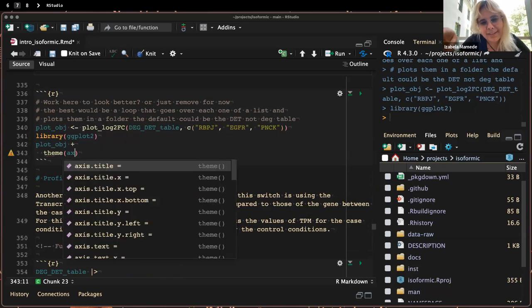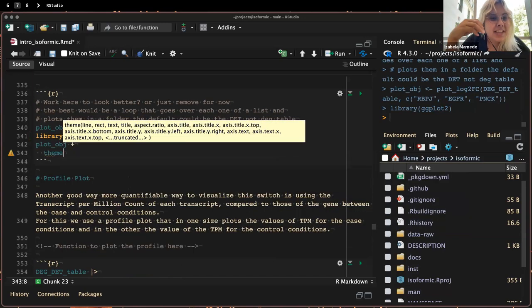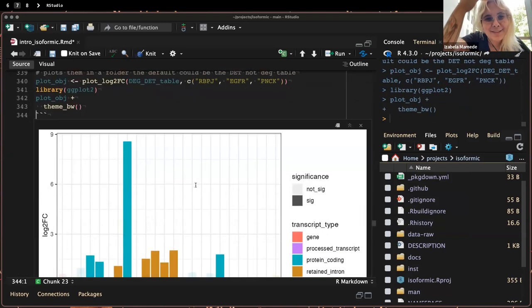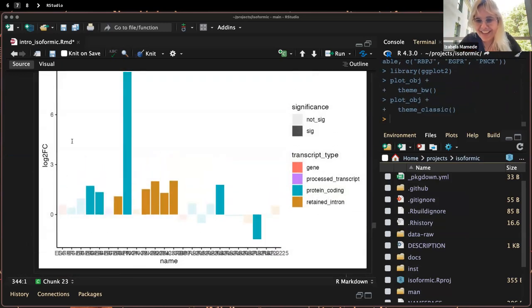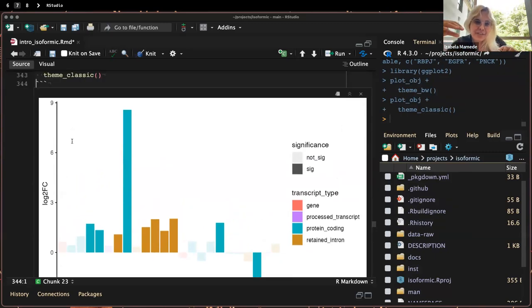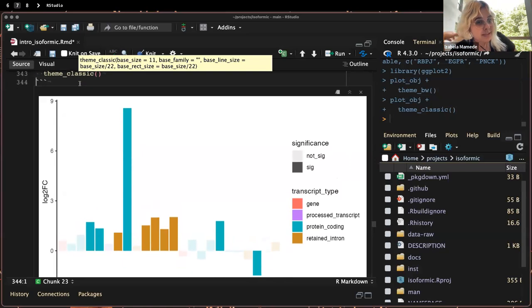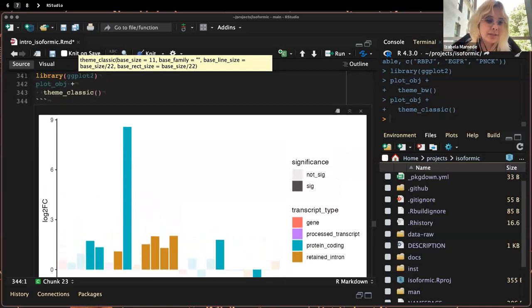But Joy commented about the publication tip on transcript level. The problem is convincing people that transcript level is important. We have a series of arguments that we go over. And exactly, it's still not perfect, but it's a plot that is easy to manipulate in ggplot, and we are using ggplot for almost everything. So it's a very easy plot to manipulate in the end.